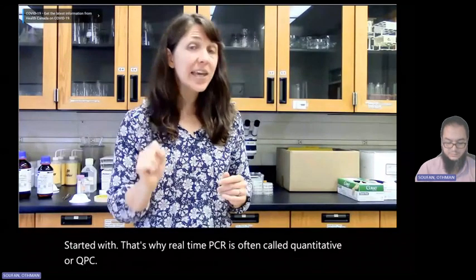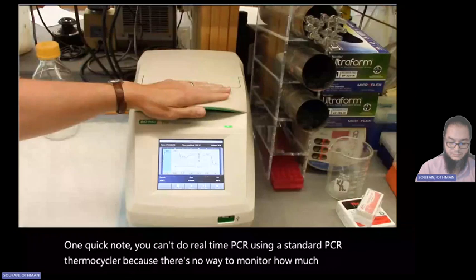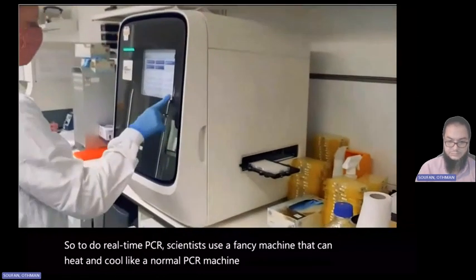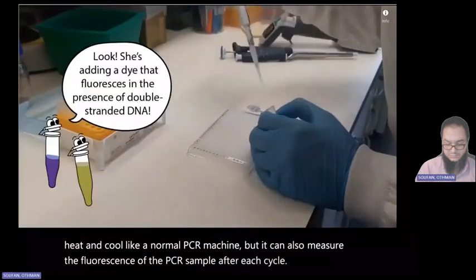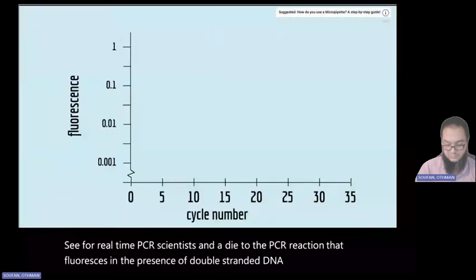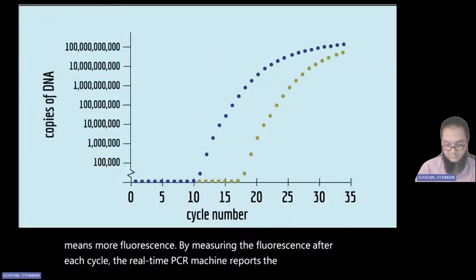One quick note, you can't do real-time PCR using a standard PCR thermocycler because there's no way to monitor how much DNA is present after each cycle. So to do real-time PCR, scientists use a fancy machine that can heat and cool like a normal PCR machine, but it can also measure the fluorescence of the PCR sample after each cycle. See, for real-time PCR, scientists add a dye to the PCR reaction that fluoresces in the presence of double-stranded DNA. More DNA means more fluorescence. By measuring the fluorescence after each cycle, the real-time PCR machine reports the amount of DNA product in real time during the PCR reaction.